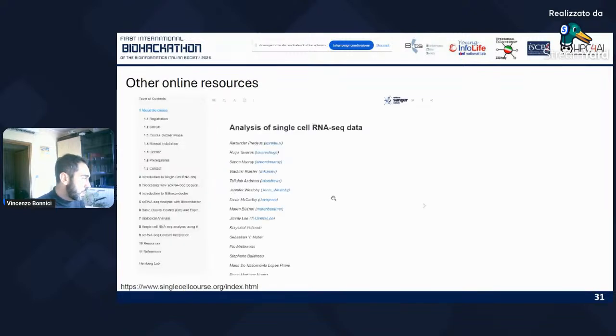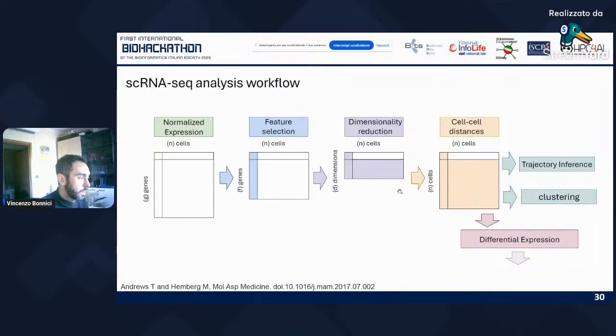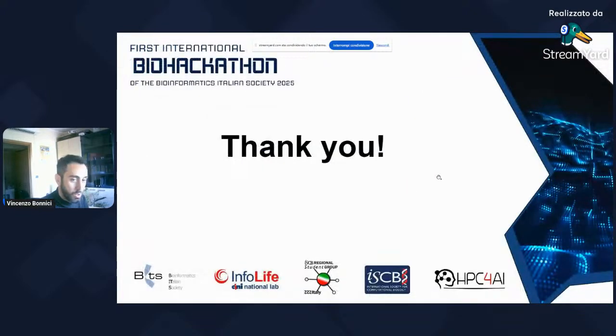So I also suggest another online resource, singlecellcourse.org, in which you can find many other considerations and indications that you can take into account for this step of the analysis, that is from the raw sequencing data to the count matrix that you will use for your analysis. So from my side, that's all.